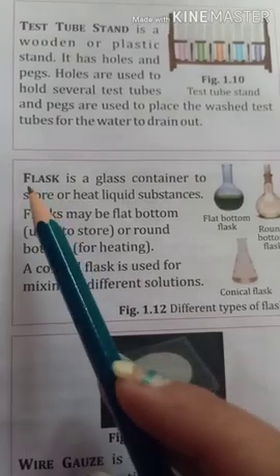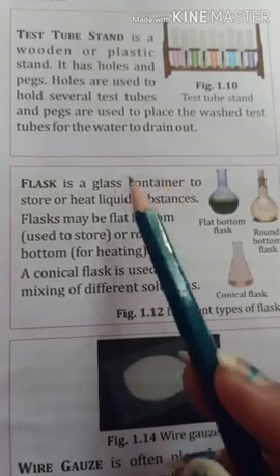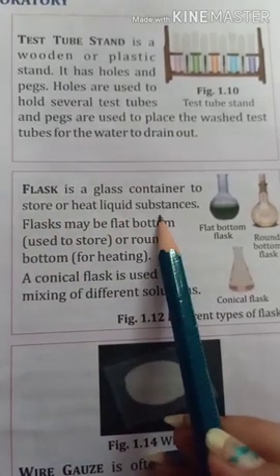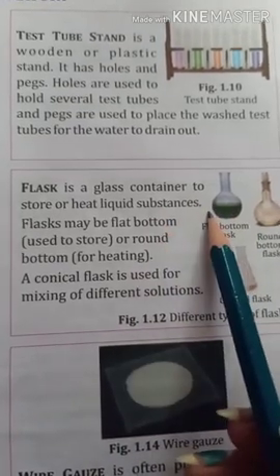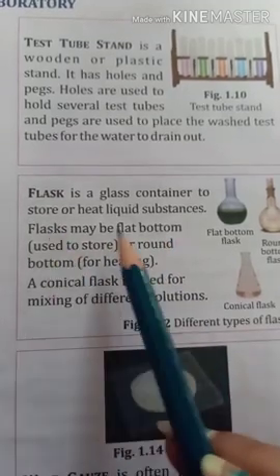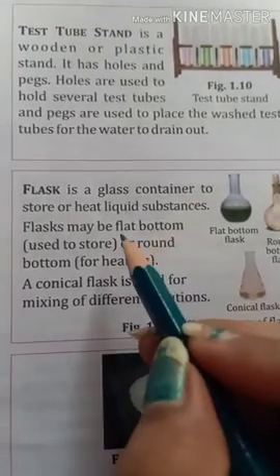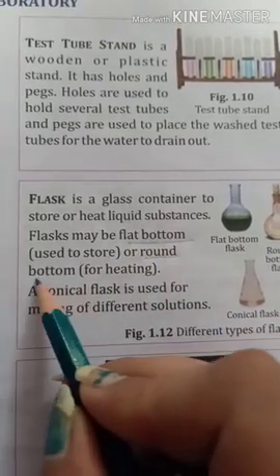Next apparatus is the flask. Flask is also made up of glass and is known as a glass container. So this flask is used to store or heat liquid substances. Flasks are mainly of two types: with flat bottom and with round bottom. So a flask may be with flat bottom or maybe with round bottom.